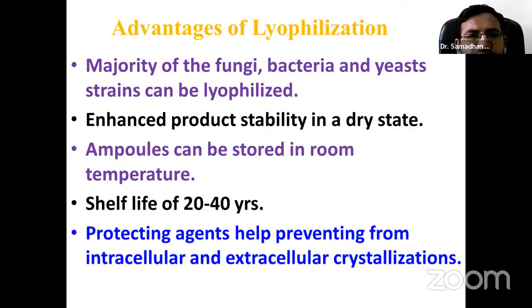Then advantages of lyophilization. The majority of fungus, bacteria and yeast strains can be lyophilized. Then enhanced product stability in a dry state. Ampoules can be stored at room temperature. Shelf life of 20 to 40 years. Protecting agents help prevent intracellular and extracellular crystallization.